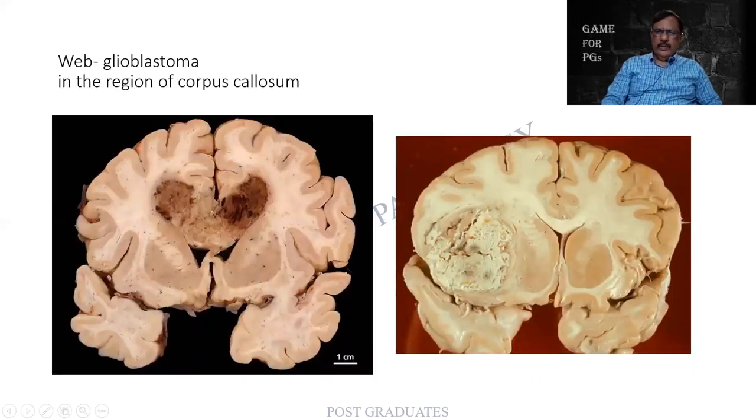Tumors as such. Sometimes you are lucky, but we do not know the extent of the tumor. This is the case of a glioblastoma. It is rather diffuse. Usually it is said that a tumor doesn't cross the midline. In this case, it crosses or rather pushes, and then I'm able to find a lesion over here. This also is well circumscribed.